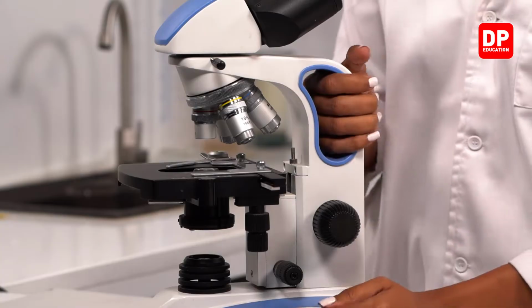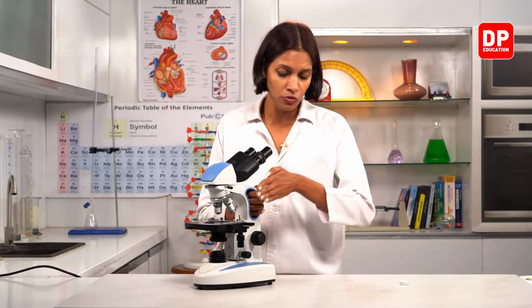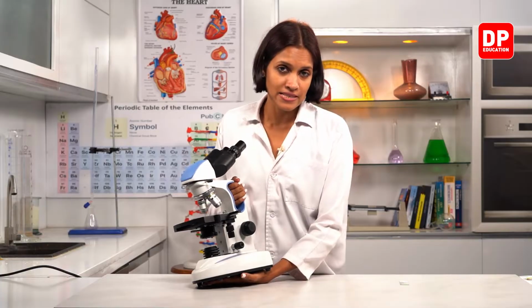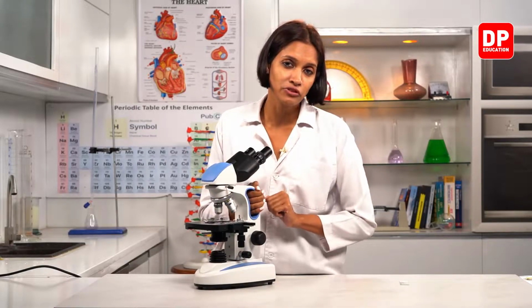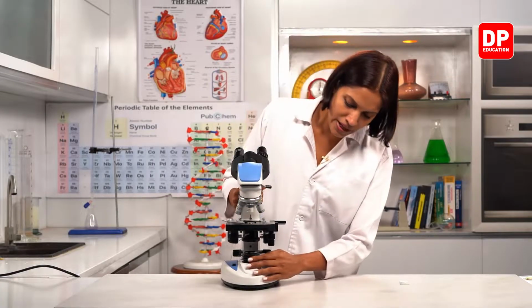Okay. So what is this one? This is known as the arm of the microscope. So when we carry the microscope, when we move the microscope from one place to another place, this is very important. Not only that, this is known as the base. Right? This is the base. We have to make sure when we carry this, one hand should go under the base, and from the other hand we have to hold this arm. Right, children?